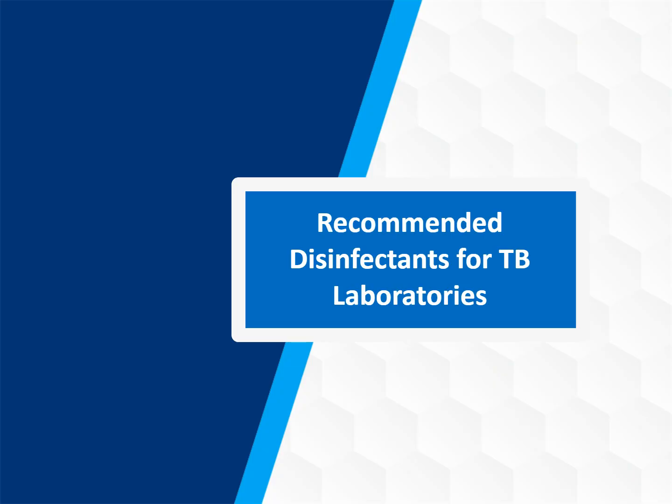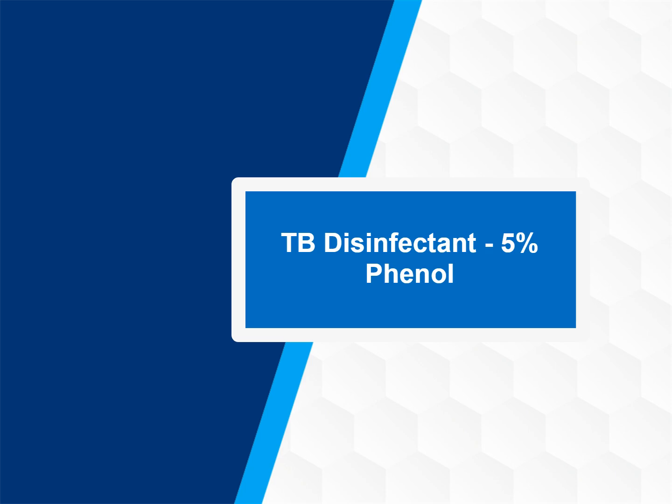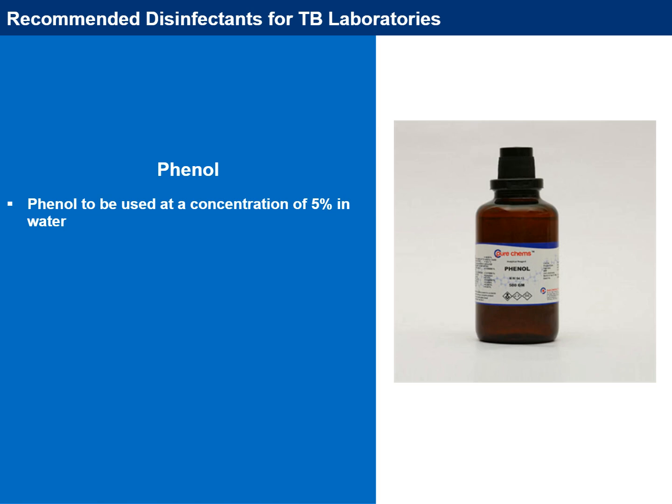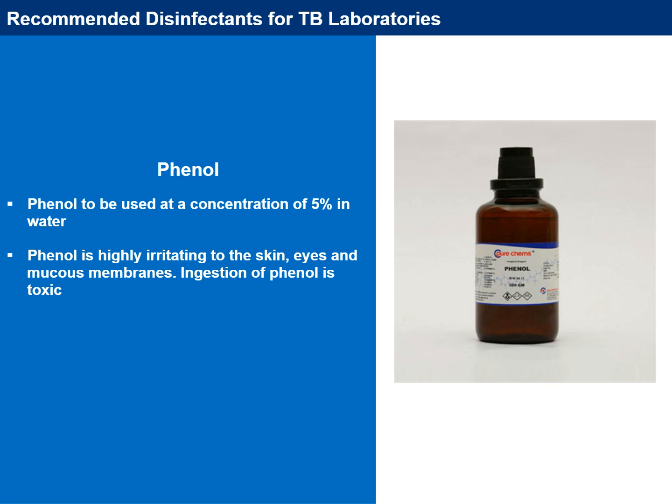Recommended disinfectants for TB labs. 5% phenol. Phenol is to be used at a concentration of 5% in distilled water. Phenol is highly irritating to the skin, eyes and mucous membranes. Ingestion of phenol is toxic. Therefore, phenol derivatives should be used in place of phenol.